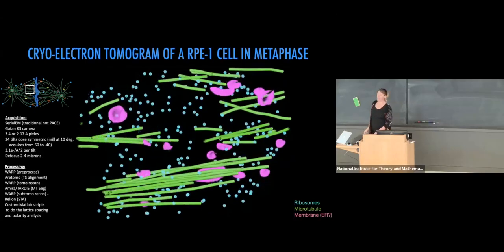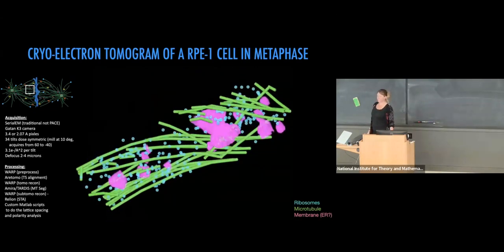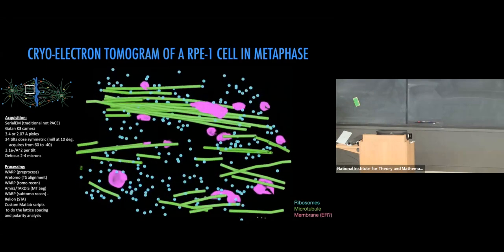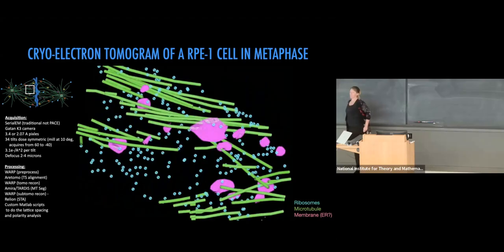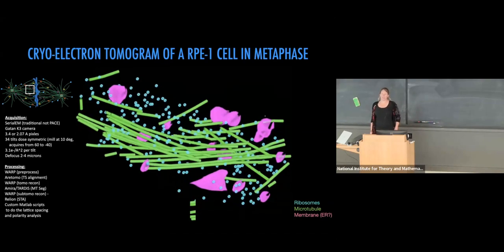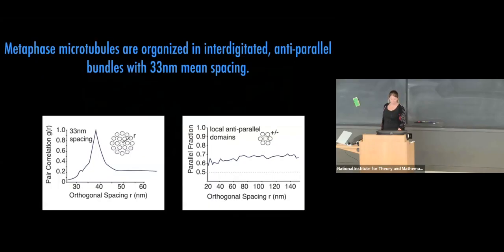Okay, there's a delay here. I see different things here than you. So this is how it would look, right? You can see now there's this reconstruction of microtubules. So the question is, what can we do with this data that we could not do in plastic? While I had high hopes that maybe we're going to see a motor or whatever else, spoiler: no motors here. But there was one parameter we could get, and you'll see it's actually super interesting.